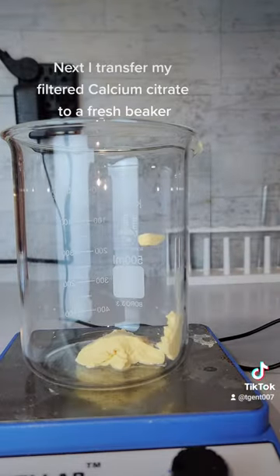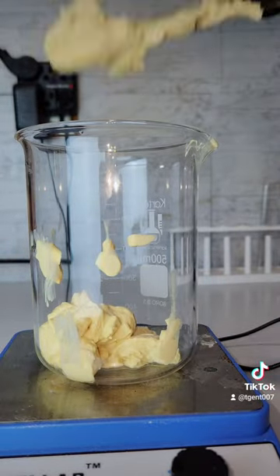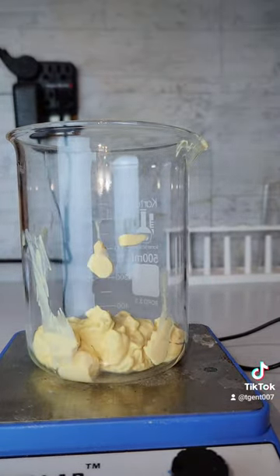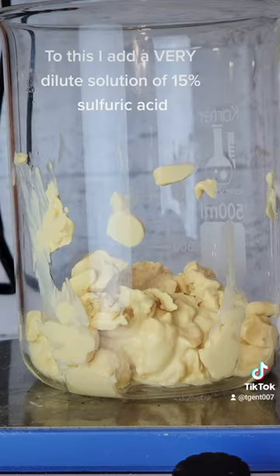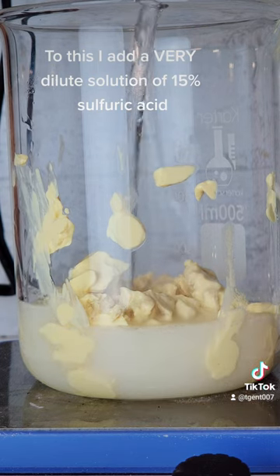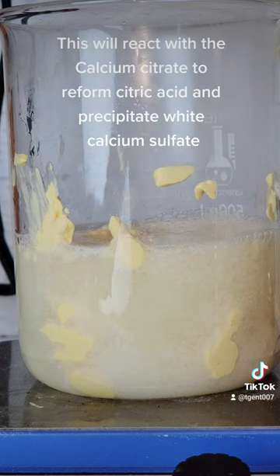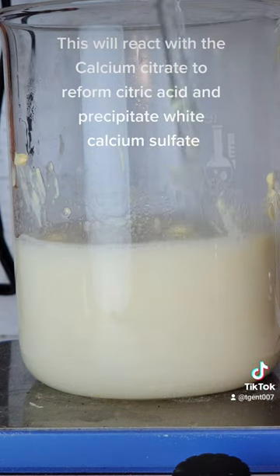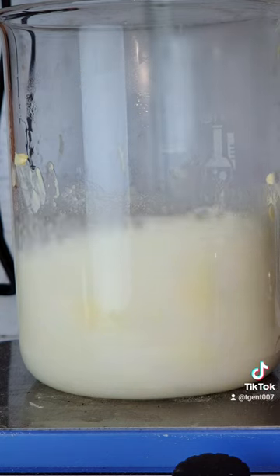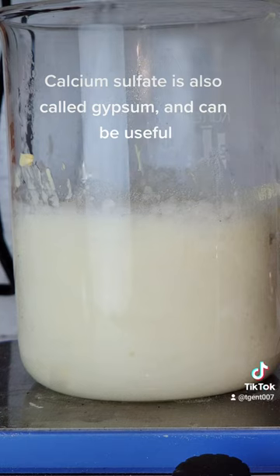Next, I transfer my filtered calcium citrate to a fresh beaker. To this, I add a very dilute solution of 15% sulfuric acid. This will react with the calcium citrate to reform citric acid and precipitate white calcium sulfate.